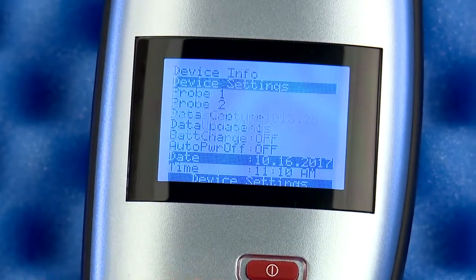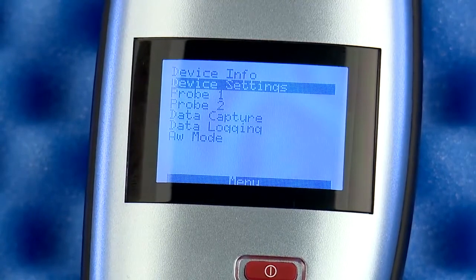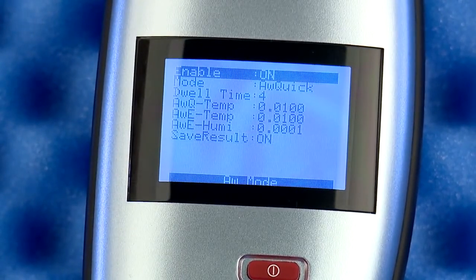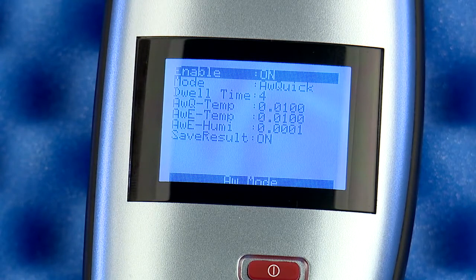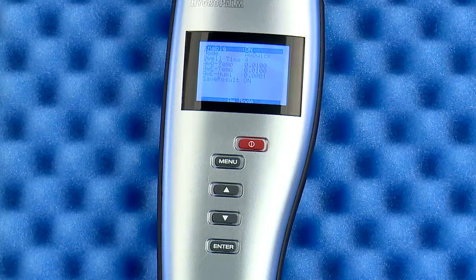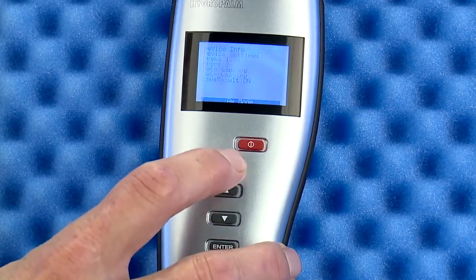Now press the menu button to return to the top menu. Scroll down to the last choice: AW mode. Ensure the enable is on and the mode is set to AW quick. The next four settings are best left at the default values. If you want the test results saved locally, make sure save result is set to on. Press menu twice to return to the main display.